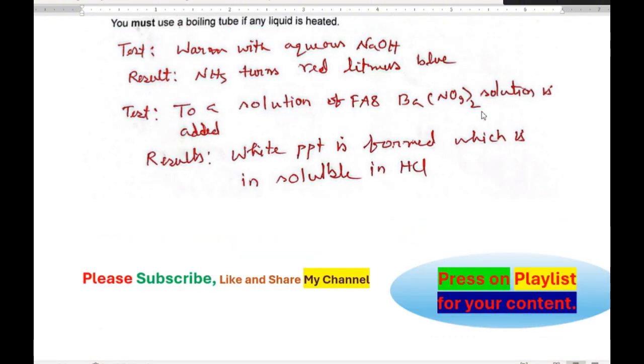Okay, dear students, before starting any salt analysis, you must follow this video and write your observation, what you would see first. Then after adding more solution, more reagent, what you would see, you must mention that.